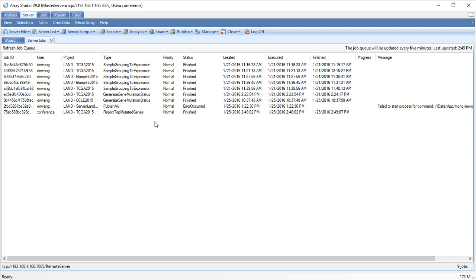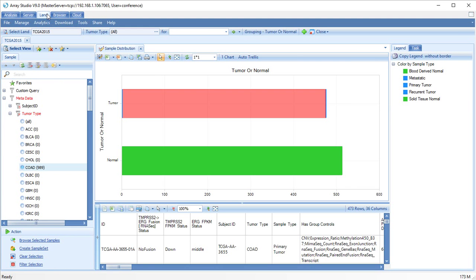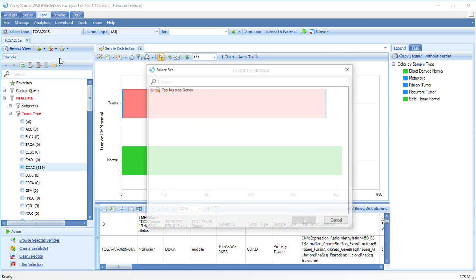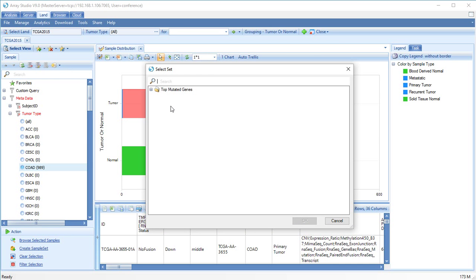When the analysis is finished, switch back to the Land tab and click Analytics, Open Results Set. Choose our result set and click OK.